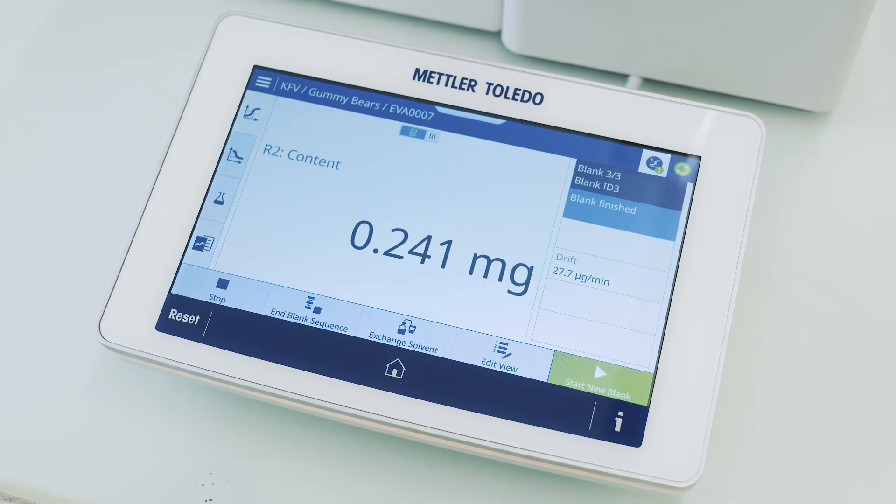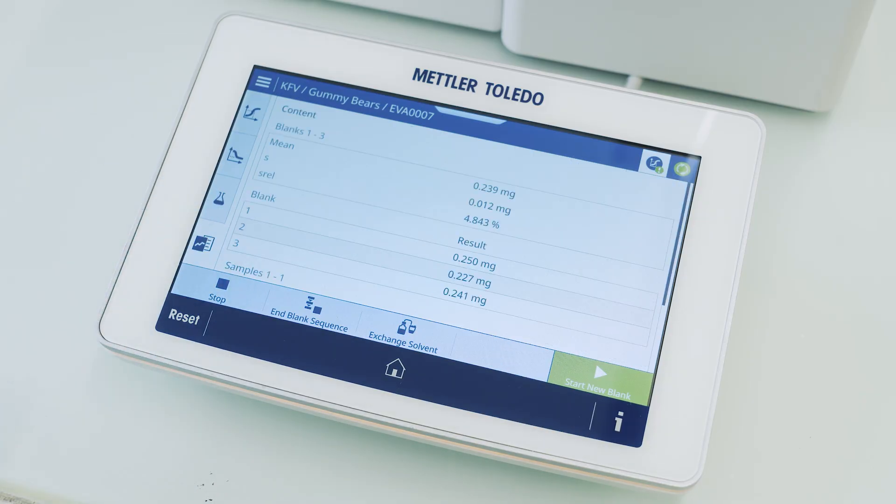I can show you the results here in the results screen where you can see the three values that we have determined beforehand.